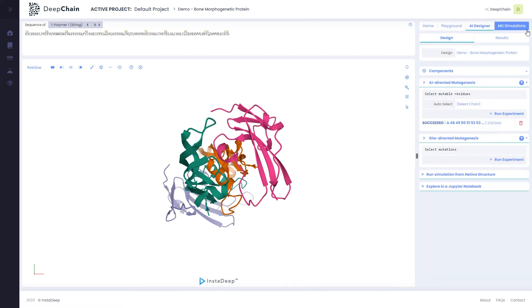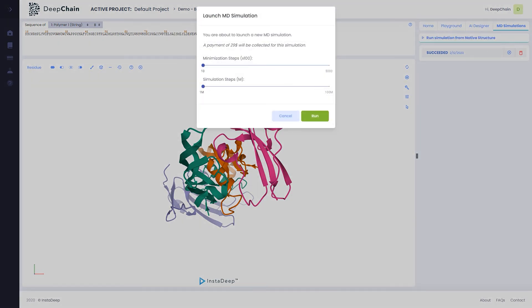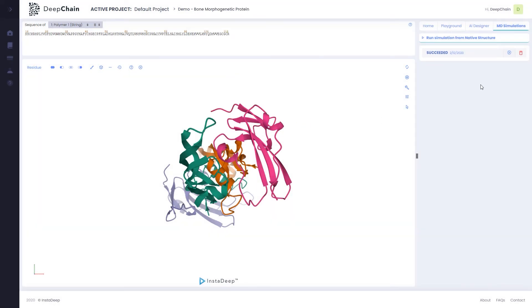We enter the MD simulations tab. Running a simulation from our design's native structure can be performed by clicking this button. The number of minimization and simulation steps can be adjusted in the pop-up window beforehand. In our case, we can see here that a molecular dynamics simulation for our native protein complex has already been launched and was completed successfully.